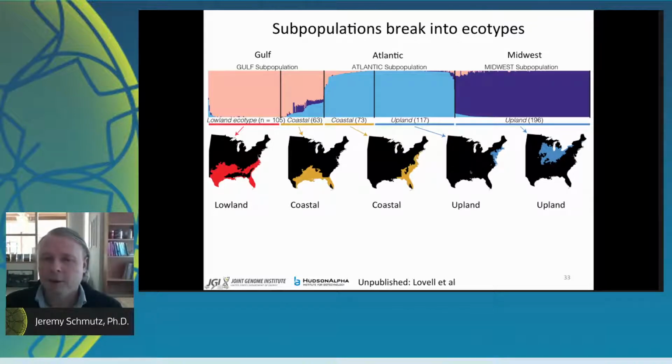And one of the interesting parts about this is that there's a whole section here that we didn't know existed. I mean, we knew the plants existed because people had seen them before, but on the genetic level, we'd never seen this data before, where the upland ecotype, that's the short kind of stubby ones, lives up here in the north, but it turns out that genetically it's lowland. And this is coming from that glaciation and collapsing and expansion, and we're intersecting that data here.